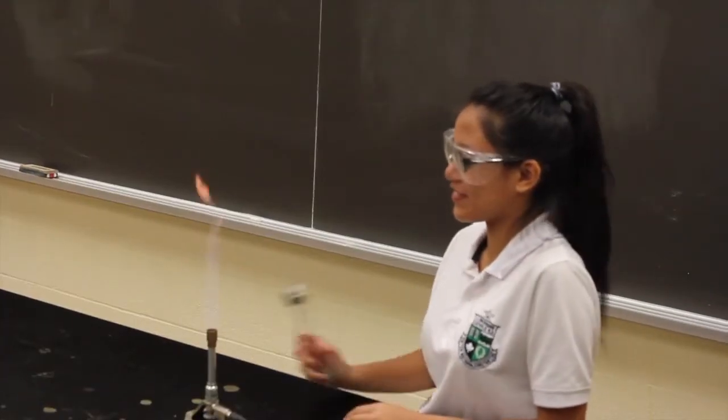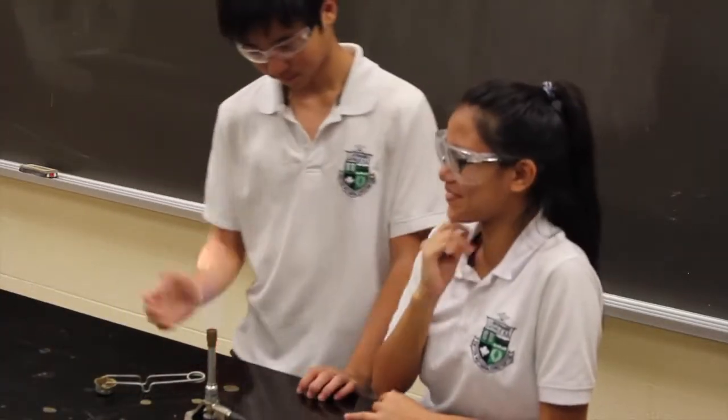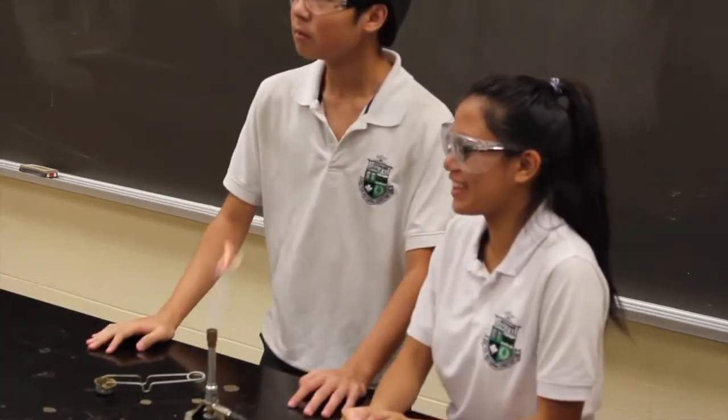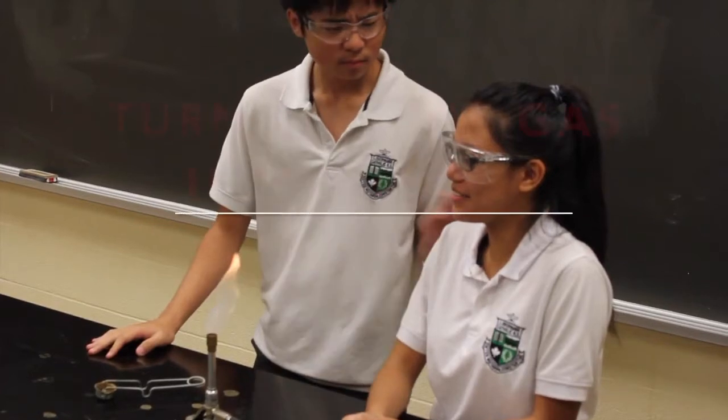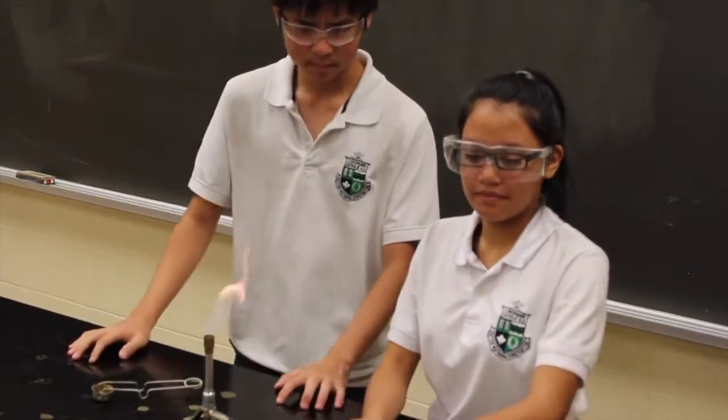Turn the gas off immediately if the flame begins to sputter or flare, or if the flame goes out. Escaped gas can cause an explosion. Also, turn the gas off if the room smells like gas, even if the Bunsen burner seems to be working as normal.